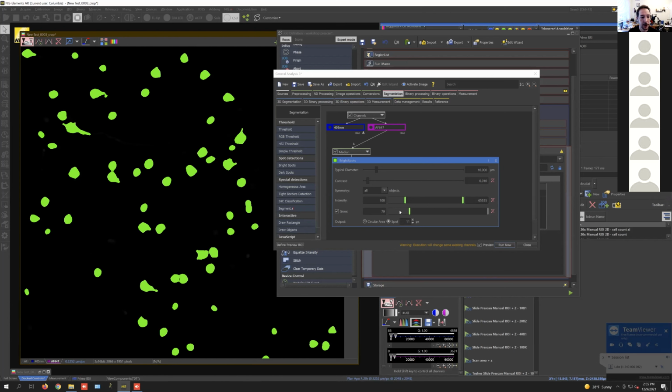So if you just did a threshold on an image, and a good example would be these cells here or these cells here, they're going to look like one cell, and you're going to have to rely on a watershed to split those cells. And if you ever use a watershed feature to split cells, in some programs it's very unreliable. Like if we ran it on this, then probably we'd end up with two cells here, even though there's one cell. And so using what's called this sort of seeded object detection is much better, because we can find all the cells and then we can expand their boundaries to the edge, and we can be very clear about how many cells there are.